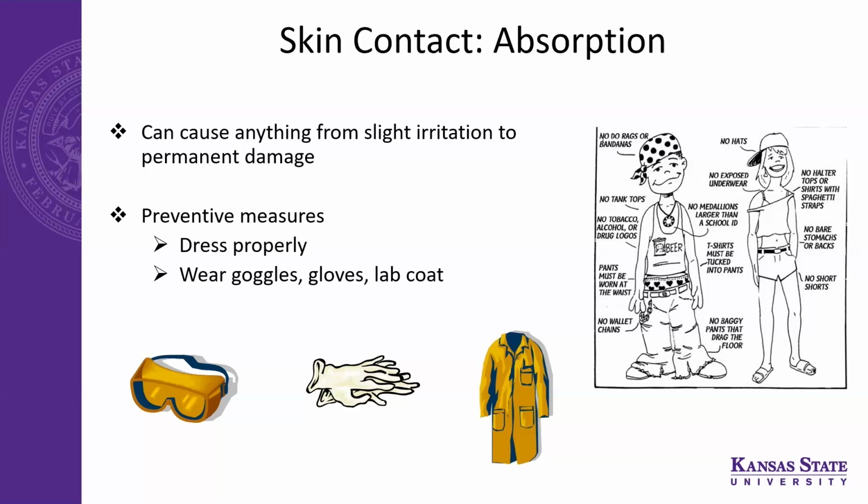And if your hair is loose, when you are moving through the lab, it can get caught somewhere else too, not only with flames. That is why it is important to have your hair tied back, be properly dressed from your neck to the toes, and have your feet covered with shoes as well.